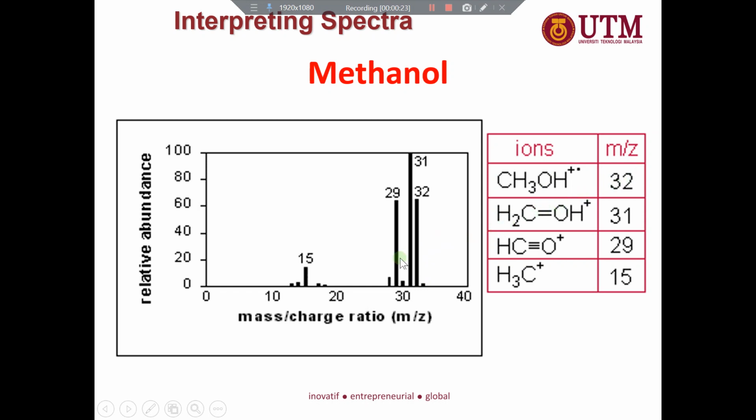But also, because of the fragment ions here, you have 31, H2C=OH. As fragment ions, you can get information on the functional groups, and then you can obtain very good structural information of the whole molecule. We can see here the base peak of this compound, m/z 31, with 100% abundance, and then you have the other peak, CH3.